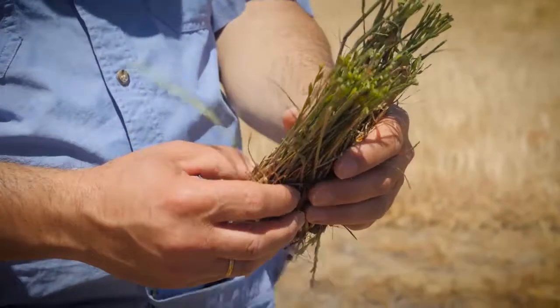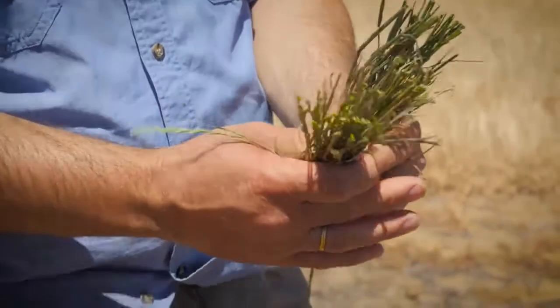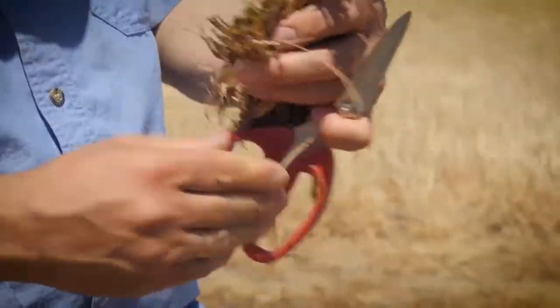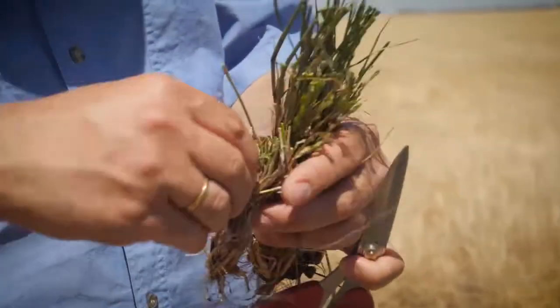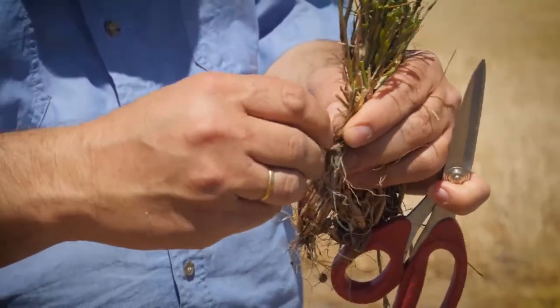Here we've got about the minimum amount of plants that we require to do the test. So once we receive the plants, what we will do back at the lab is we'll make tiny little cuttings out of all of these plants, and plant them into pots. If they're multi-tillered like that, we split the tillers, making little cuttings.